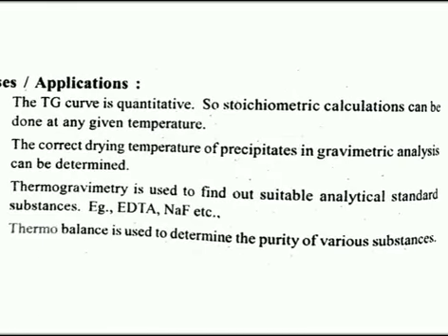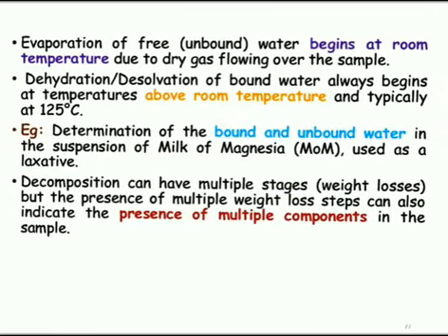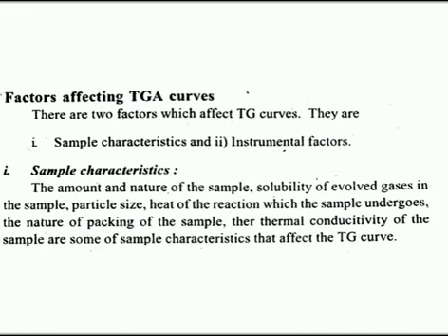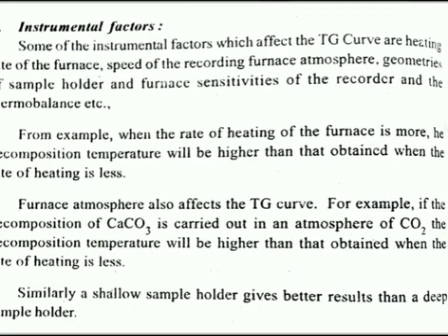Then we discussed some of the uses or applications of the TG curve, some of the information we get from the TG curves, or the merits of thermogravimetric analysis, and the factors affecting TGA curves: sample characteristics and instrumental factors. Thank you.